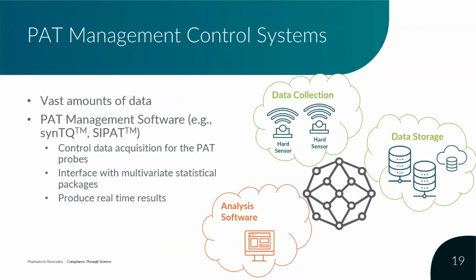So when you're deciding on placement of process analytical probes, you need to make sure you've got some sort of a port nearby that you can actually remove a sample manually and confirm the result of the process analytical technology probe against, for instance, an HPLC method or maybe a UV method. But the placement of those probes is a very important aspect that you really need to consider.